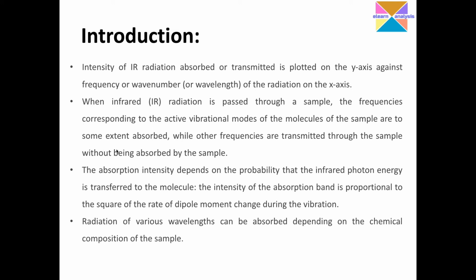So the reason for this whole statement is, when you subject a molecule to infrared radiation, if that molecule has some portion in it which responds to the incoming infrared frequencies, then a resonance happens.